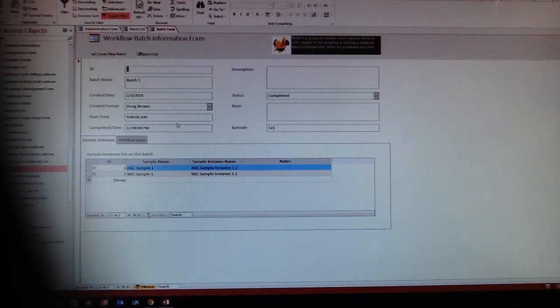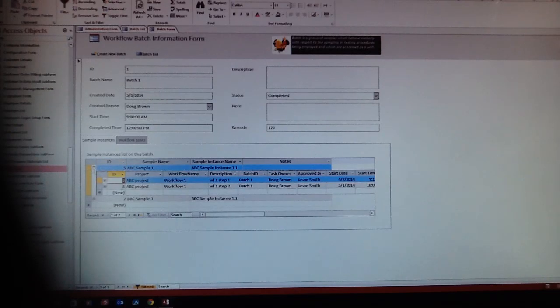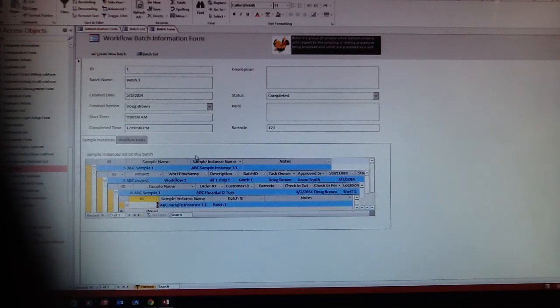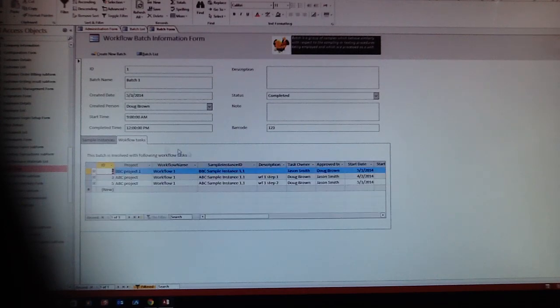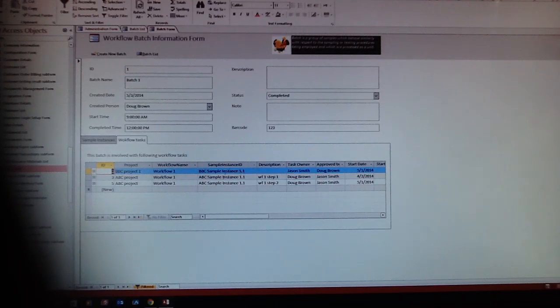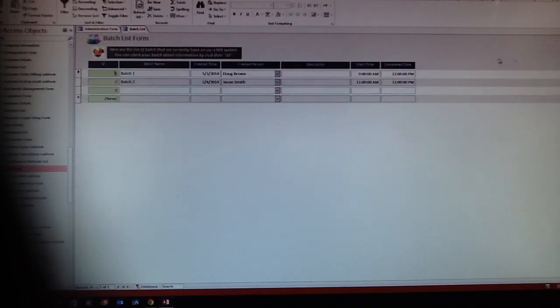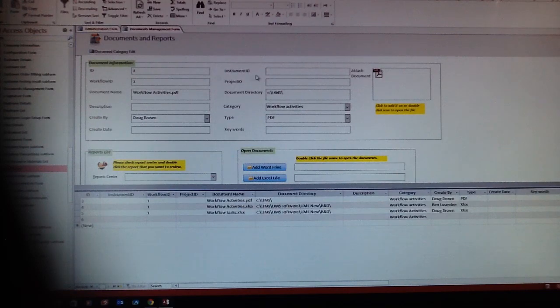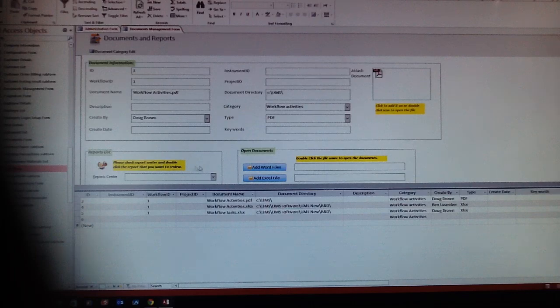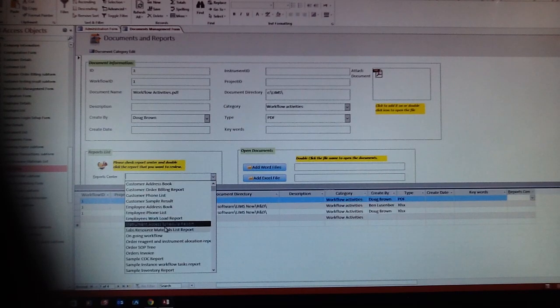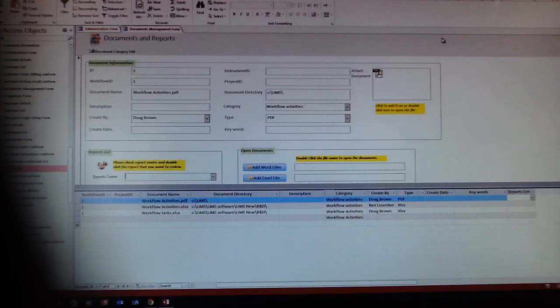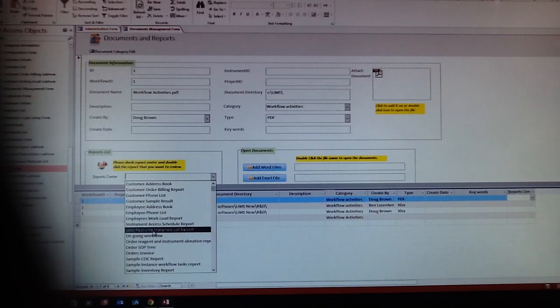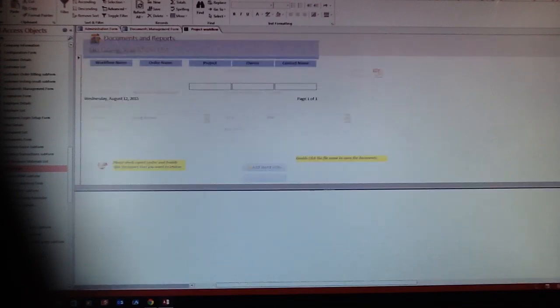For batch one, they will involve ABC sample ones and BBC sample ones, projects here, and sample information. They list all the samples. Here is the workflow, so batch one will involve project workflows and sample instances over here. That's the result and documents. You can trace those document information and results over here, and here's all those reports that we provide. You can check those reports by simply clicking on the report's name.